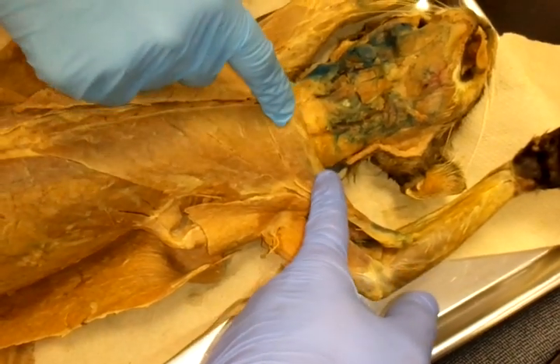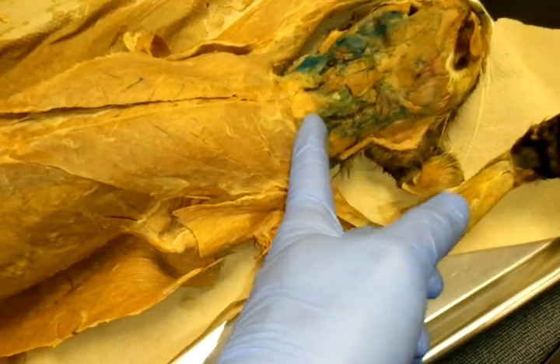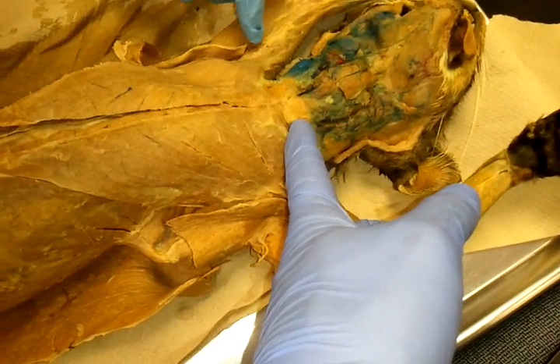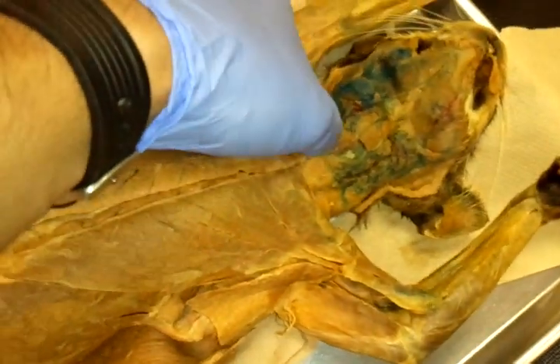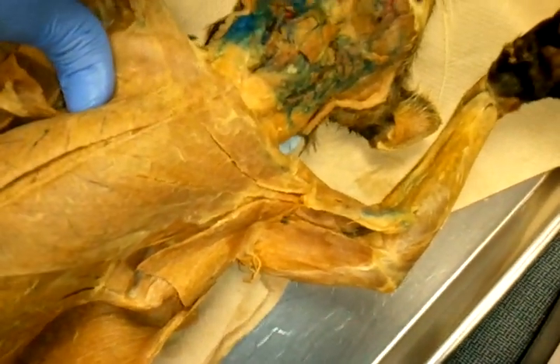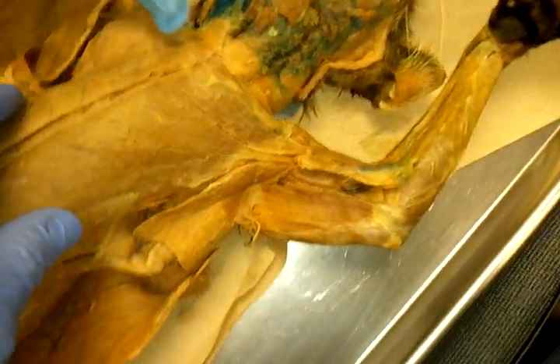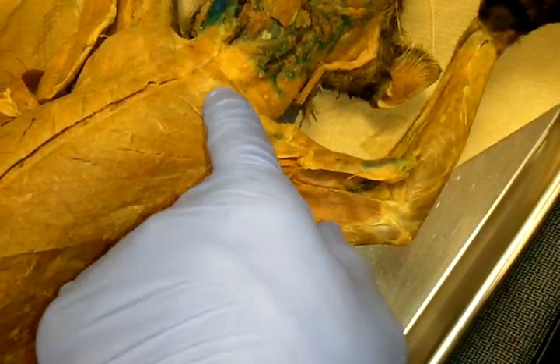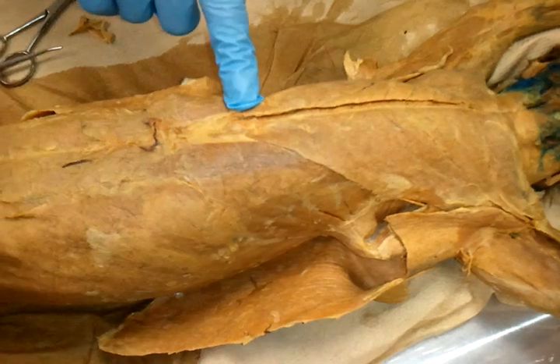Now this is the pectoantobrachialis — but we don't care about that one. That muscle right here — the book says it's also part of the major, but that actually looks like it's part of your sternocleidomastoid. Pectoralis major is not inferior like this one.